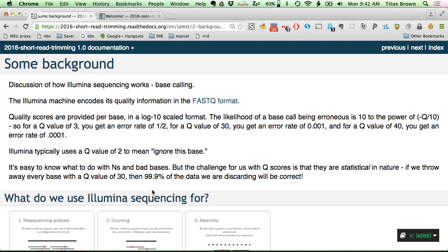And you watch that spot, and as you add each fluorescent base, you record what color that spot fluoresces with. So an A might be red, and if an A is the next base to be added in a sequence, and A is red, then you'll see a red flash at the particular spot on the slide that you're looking at. And so what Illumina does is it images the slide in massively parallel.